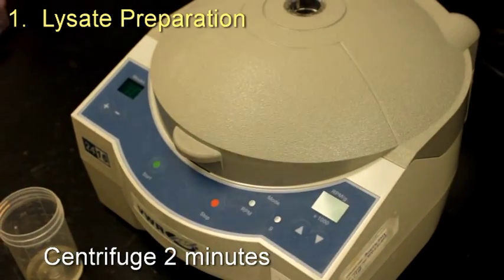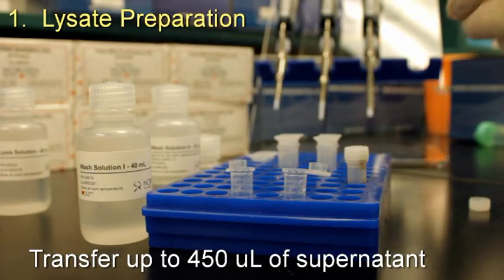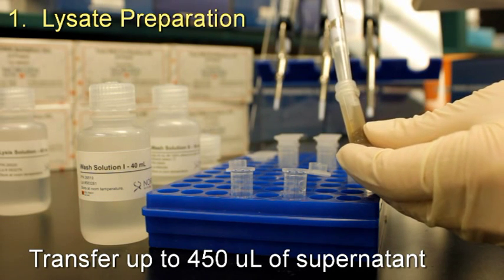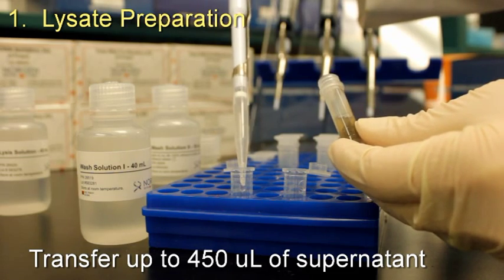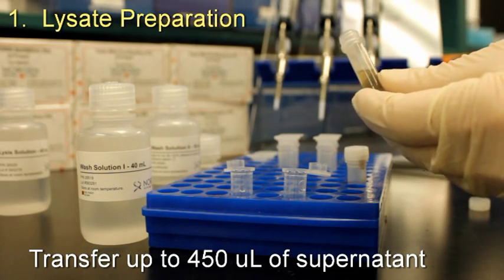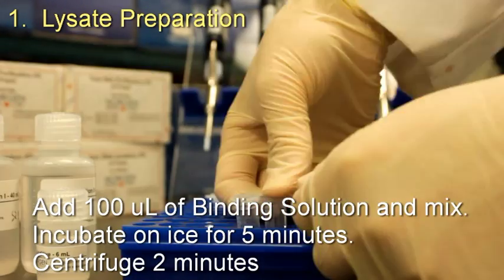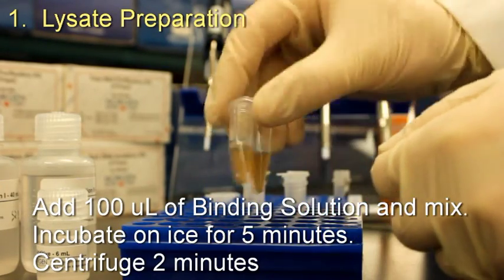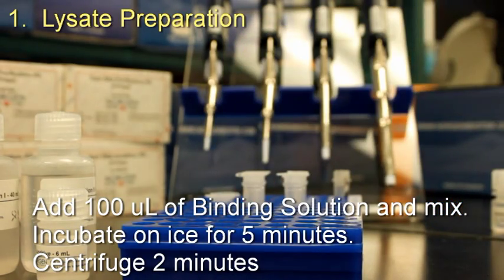Centrifuge for 2 minutes. Transfer up to 450 microliters of supernatant to a microcentrifuge tube. Incubate on ice for 5 minutes and centrifuge for 2 minutes.